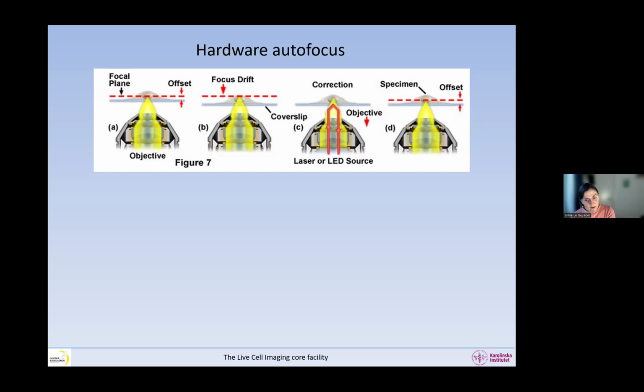And that oil does not evaporate, but it has the same refractive index as water. So what you need to do is ask Leica if they have such an oil. Then you don't have to bother with whether it is evaporating or not, and you still have the correct objective.